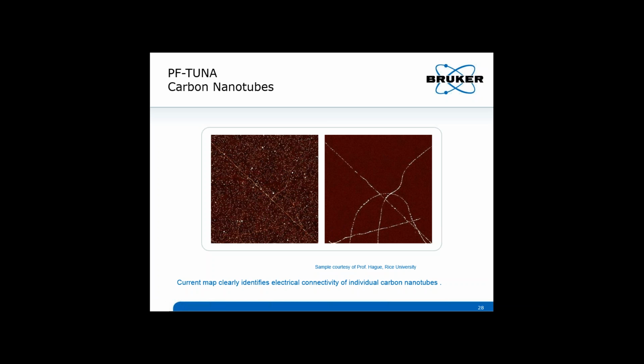It is worth noting that while the nanotubes are fragile, they can be pushed about with an AFM tip in contact mode. But here we can see clearly the carbon nanotube without it being pushed away by the AFM tip. With PF TUNA, the SCM-PIT tip endured for several hours without the coating being worn off by the substrate. This cannot be achieved by contact mode imaging.